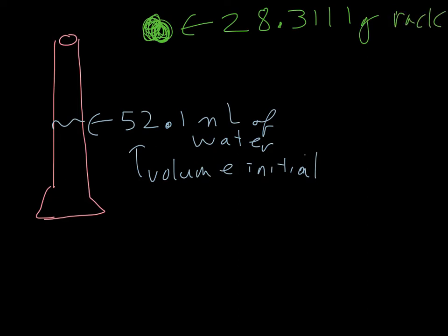Remember, never disregard sig figs given to you by an instrument until your calculations tell you. So when you take that mass of your unknown, that balance gives you 4 decimal points. So I better see 4 decimal points in your lab book.